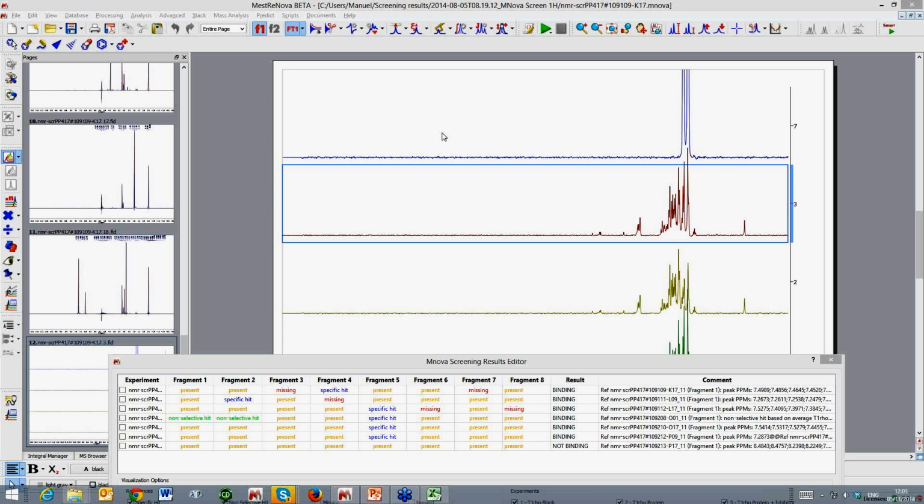Are you thinking more in a case of a principal component analysis, more along those lines? Okay, so you're looking more at stability. In principle, I don't see why not. But this is a bit of a rush answer from my side.